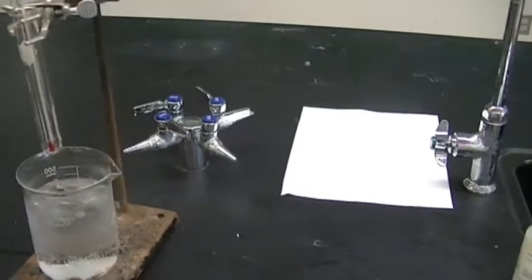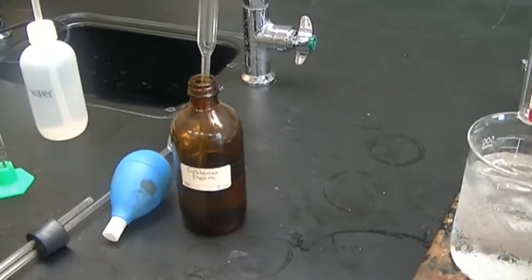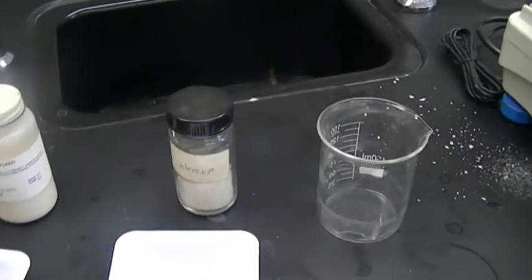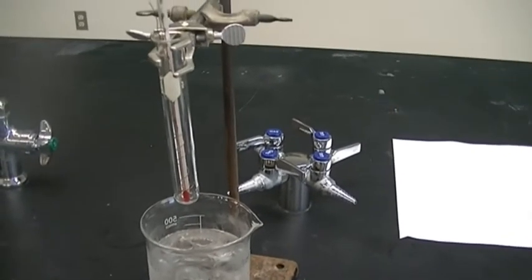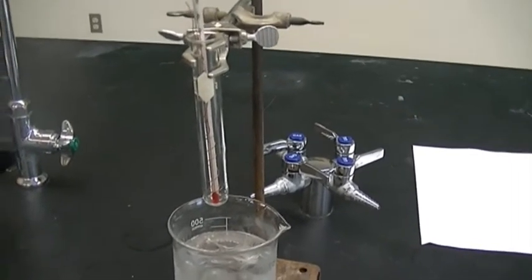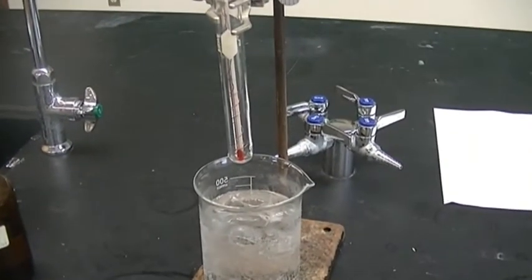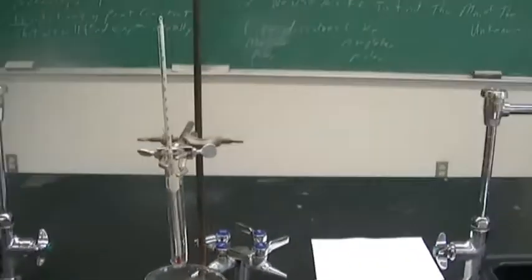And then once we have that, we're going to have to get a new sample of our cyclohexane, another 10 mil sample, and then we're going to dissolve the unknown in there and get the freezing point of that. So we will have to do 3 different freezing points: pure cyclohexane, cyclohexane plus naphthalene, and cyclohexane plus the unknown.